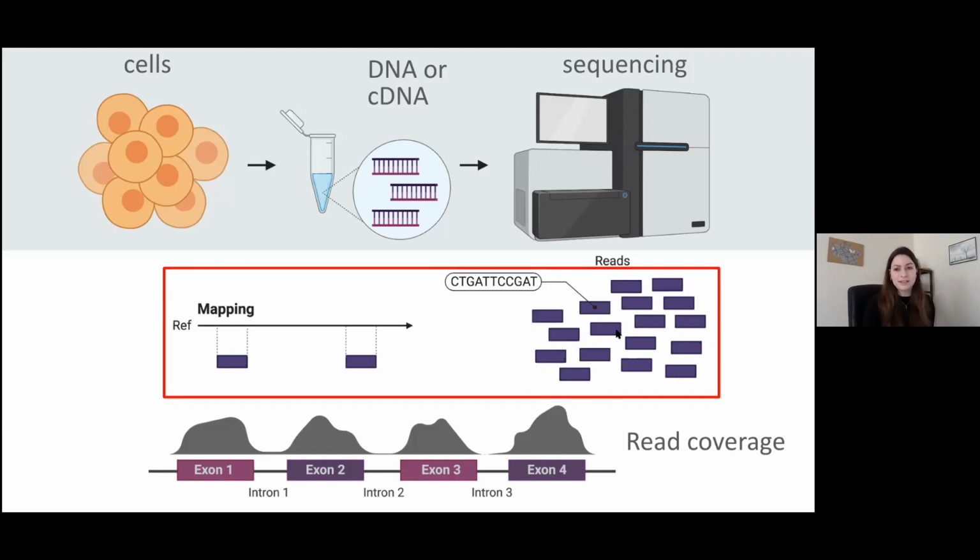We usually say Fasta, but in theory, if you want to be strict about it, it's Fasta. All right, so what are these files and how should you read them?